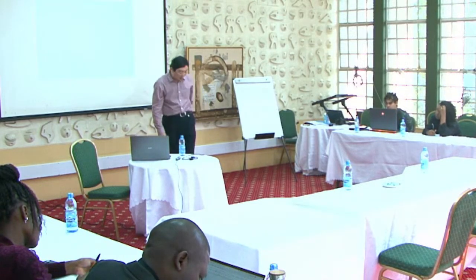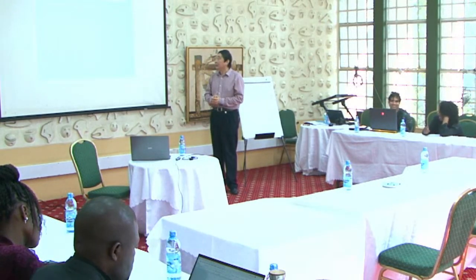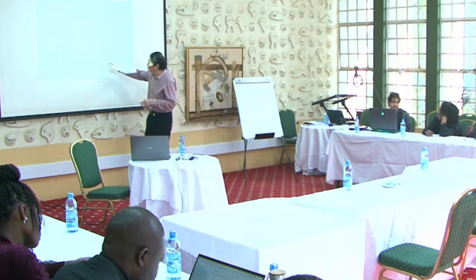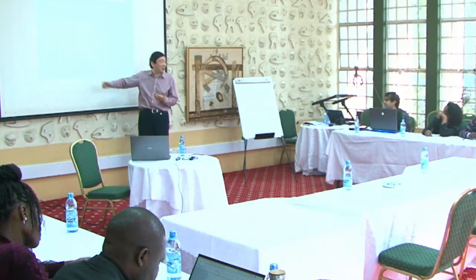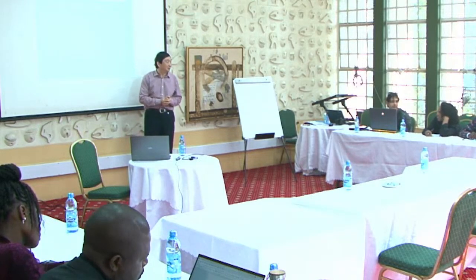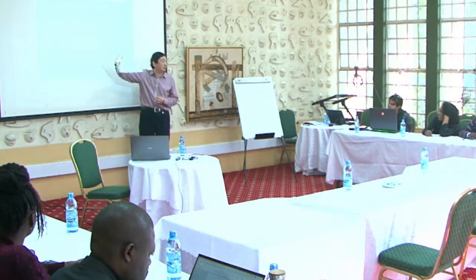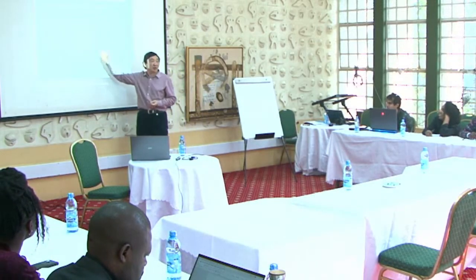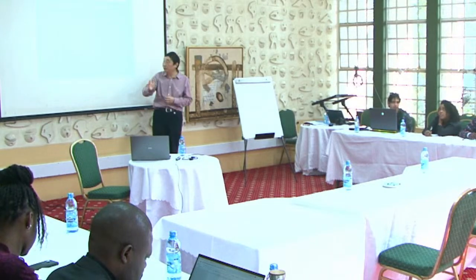So now let's have some real questions. So for this one, this is a very small molecule, right? You see what's the molecular ion. Of course the spectrum you measured will not tell you it's the molecular ion. So you first need to say, okay, since this is the highest mass over Z, you're looking for the molecular ion, you're always looking for the highest mass over Z.